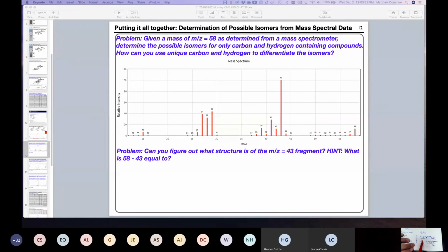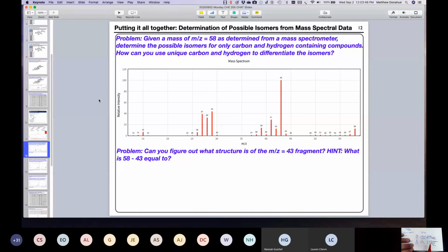So if you look at these two structures, you see that this linear one has 1, 2 methyl groups. The branched one has 1, 2, 3. So I'm inclined to say that the data you are looking at belongs to this structure, because if you think about it, you can lose a methyl group here, or you could lose it here, or you could lose it there.